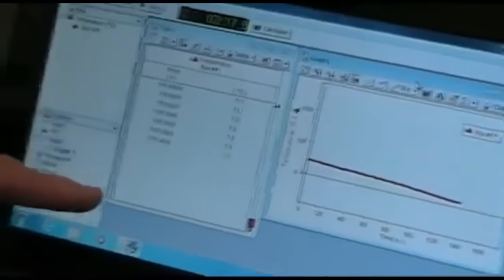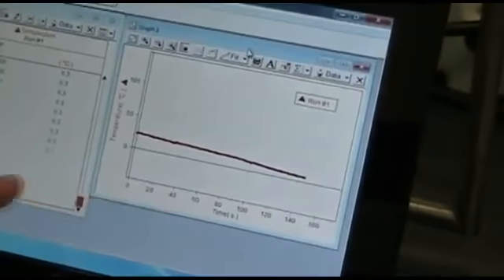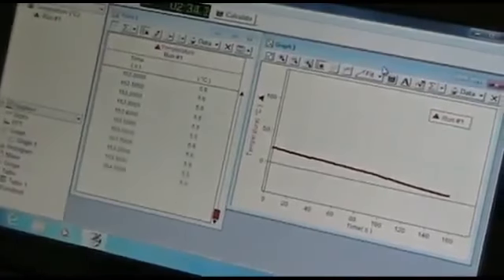The temperature is being recorded every second, or I'm not sure, and you can see that the graph is continually going down to 0. We'll pick it up when our solution gets a little slushy, and when it gets slushy we'll be stirring it to maintain a constant temperature. Notice the frost, so you might want to scrape that so you can see what's happening inside the cooling jacket.